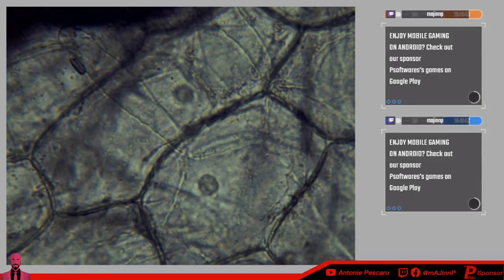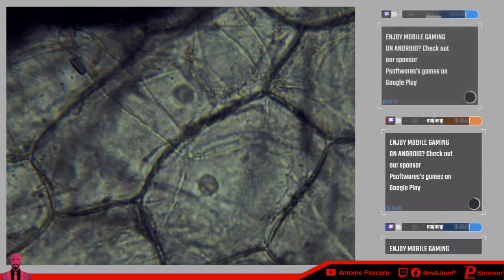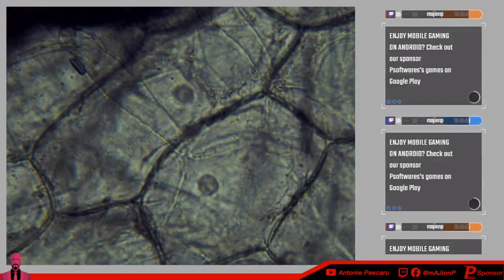Now, as I said, there's an unfortunate thing that I can't do, is that I can't put the 40x. I can't put that one in because it goes way too far. It's way too big for it.